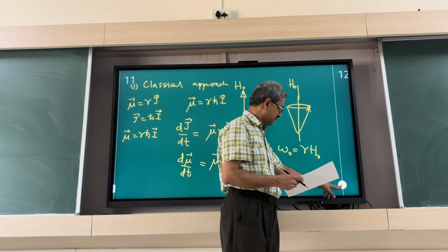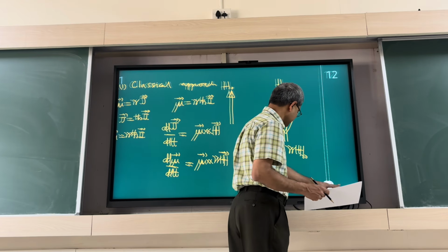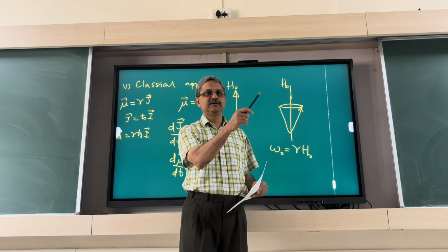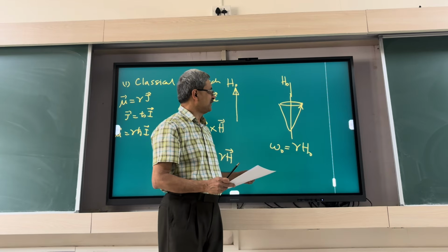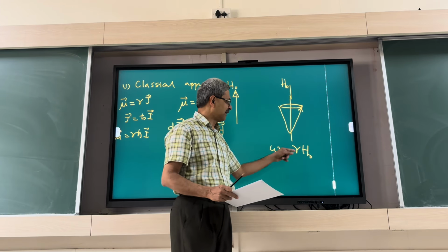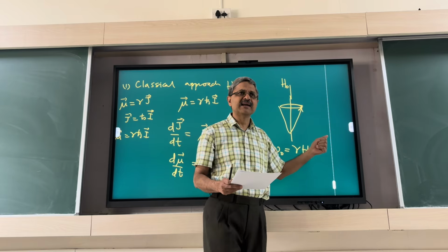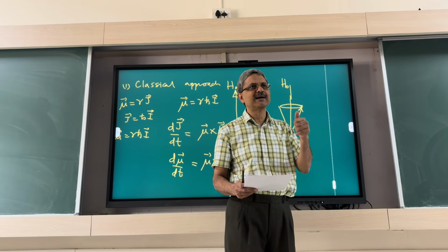Next question, again basic classical mechanics. Those who have been doing NMR for a while know that I'm in the lab frame, I apply the DC field, and I should see nuclei going this way. The RF field is not yet applied. Ultimately you're going to apply an RF field, but what will the RF field do? Firstly, remember, if I apply a field, RF or whatever, in the same Z direction, it's not going to do anything. You need to get a torque.